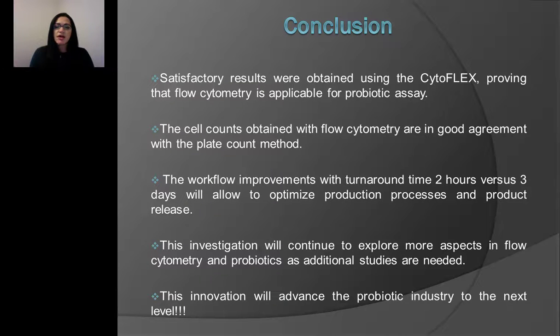So in conclusion, after doing several trials, we figured that we would do comparative studies, because we wanted to make sure that we really got accurate data, and that the method of flow cytometry was really going to increase our quality control systems.